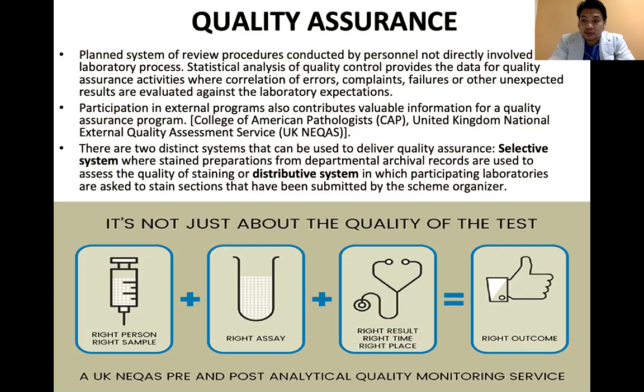Okay? So we have to check our SOP from time to time if there are already discrepancies, or if there are things that can no longer be done, or if there are updates. Okay?